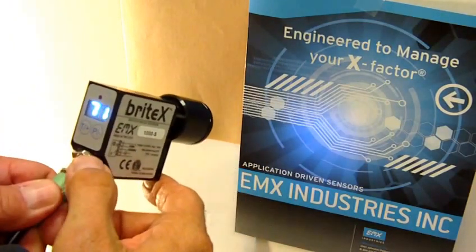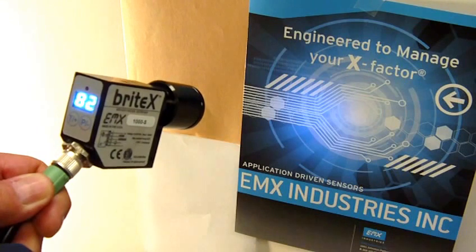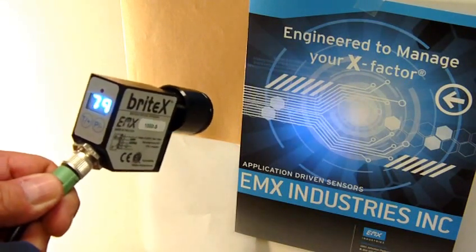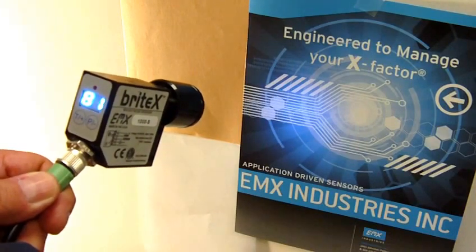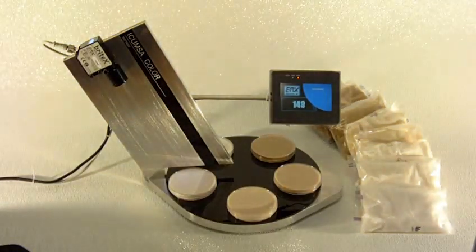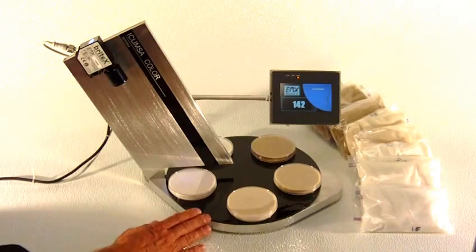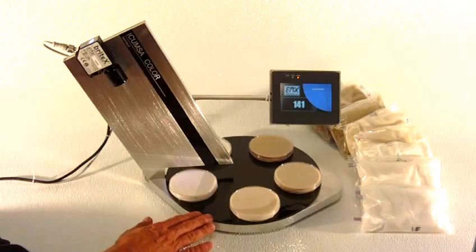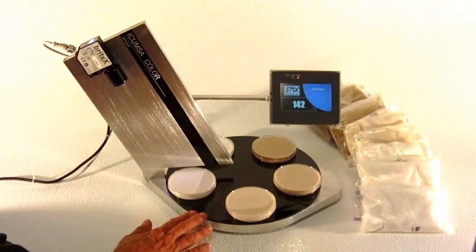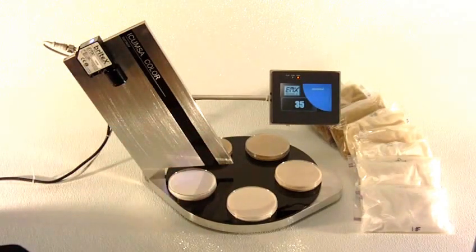The sensor also features a 0 to 5 volt analog output which can be connected to any kind of process equipment where an analog input can be provided. That signal can be correlated to ICOMSA sugar values as we will see in our demonstration. Here is a display for the BrightX sensor showing ICOMSA color of several different samples of sugar, ranging from table sugar to approximately 1700 ICOMSA. We'll start with the table sugar, with the sensor connected directly to an HMI device.